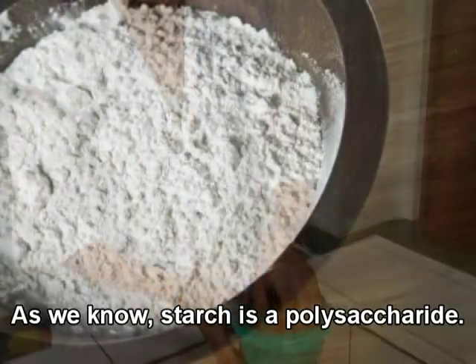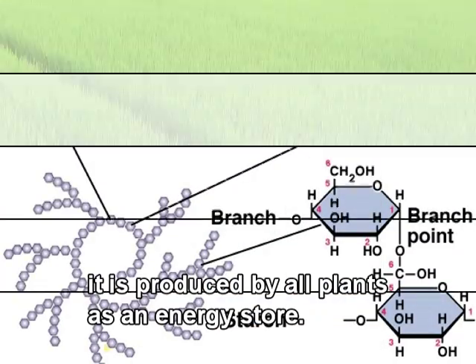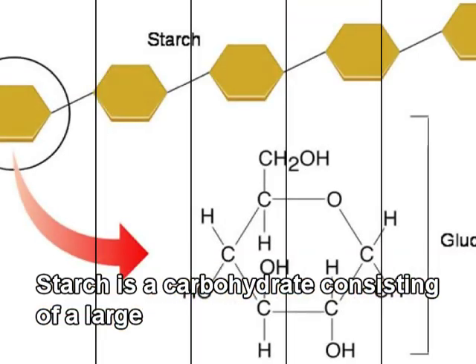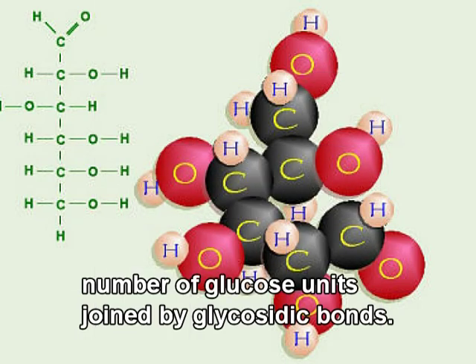As we know, starch is a polysaccharide. By polysaccharide, we can point out that it is produced by all plants as an energy store. Starch is a carbohydrate consisting of a large number of glucose units joined by glycosidic bonds.